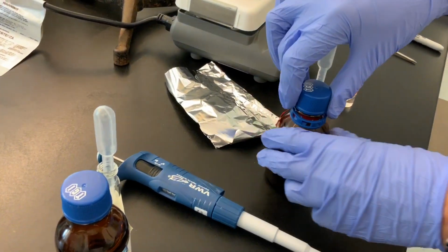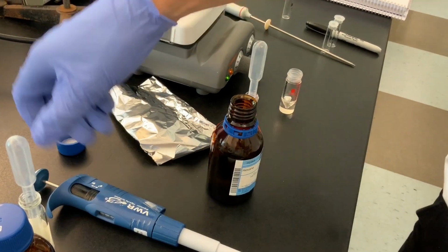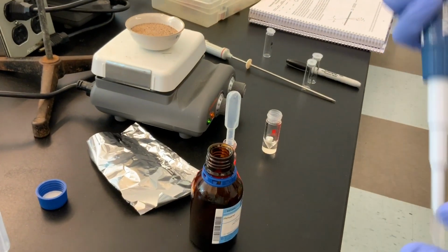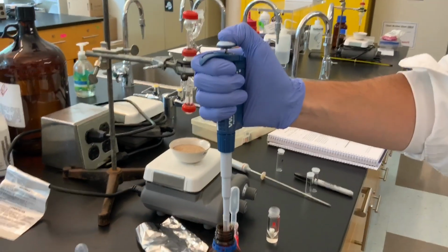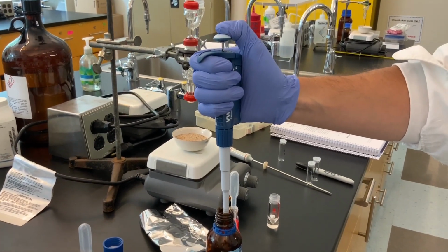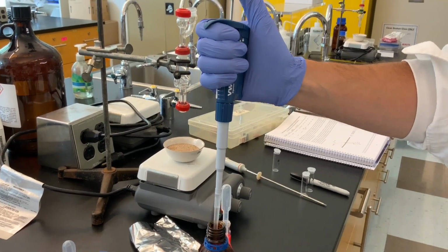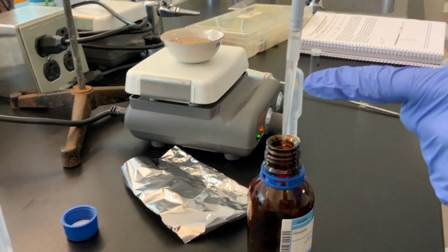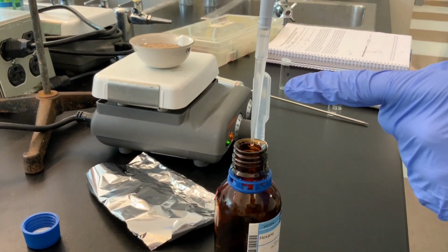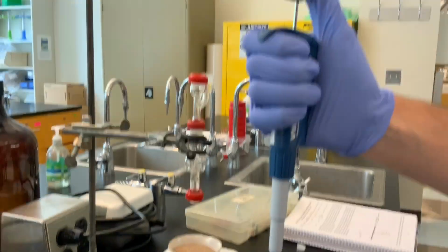All right, so here's hexane, boiling point 69 degrees. It is a clear, colorless liquid. Also, we call that a water white liquid. It doesn't really have an odor. It's just sort of an industrial odor. And so now here, if you look at my pipette tip, this is what is 1 milliliter, right? And so this is what I'm going to deliver, and then the second level of resistance just gets everything out.